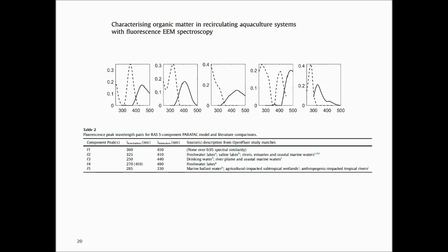So quite interesting in terms of their ability to describe the system state, because the organic matter was a good proxy to describe the system overall, because they used marine or saline water to fill up the tank, and they used tap water to dissolve the fish feed, as well as they found seemingly ubiquitous reaction intermediates of organic matter. So they were already, just by using OpenFluor, able to describe their system in a sufficient manner.